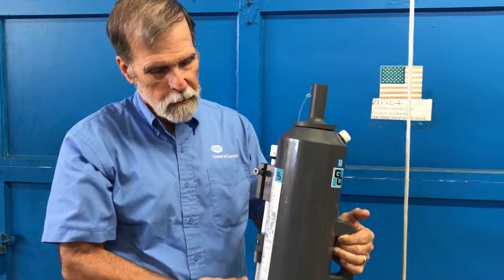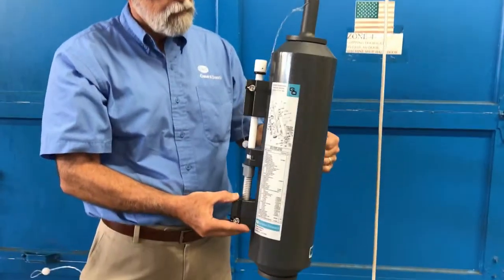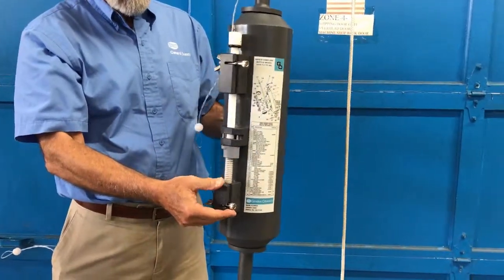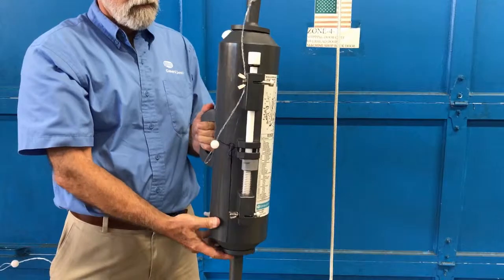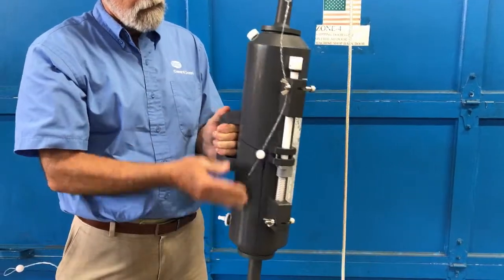The following is a demonstration of how to use the General Oceanics 1010 series Niskin water sampling bottle. The Niskin bottle has a main housing made from PVC pipe.